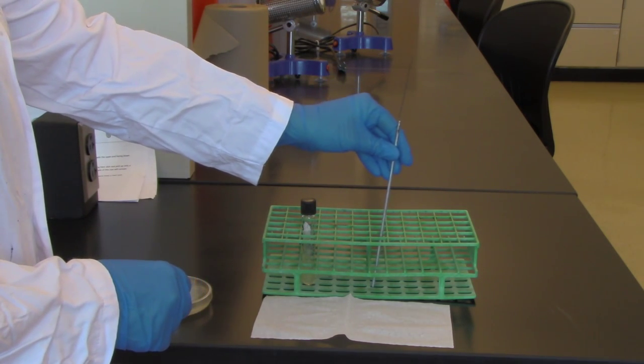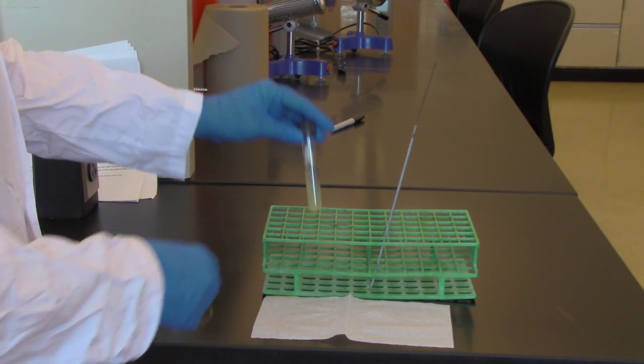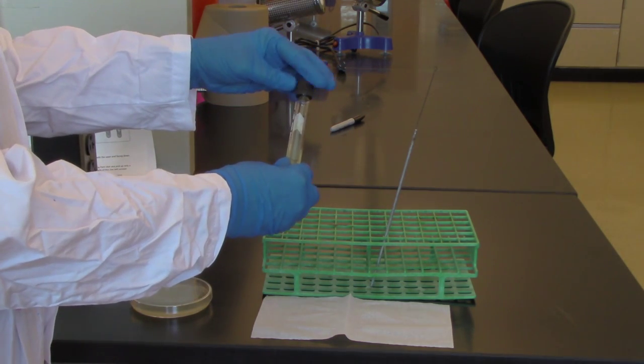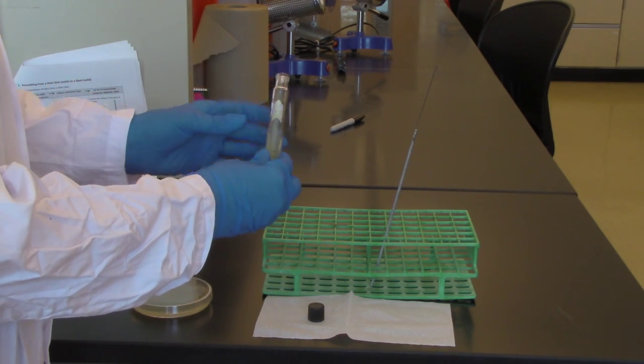I have my sterilized loop. I'm going to set it aside here for a moment. I'm going to pick up my slant, remove the lid, put the lid face down on a clean kim wipe, and hold onto the tube.